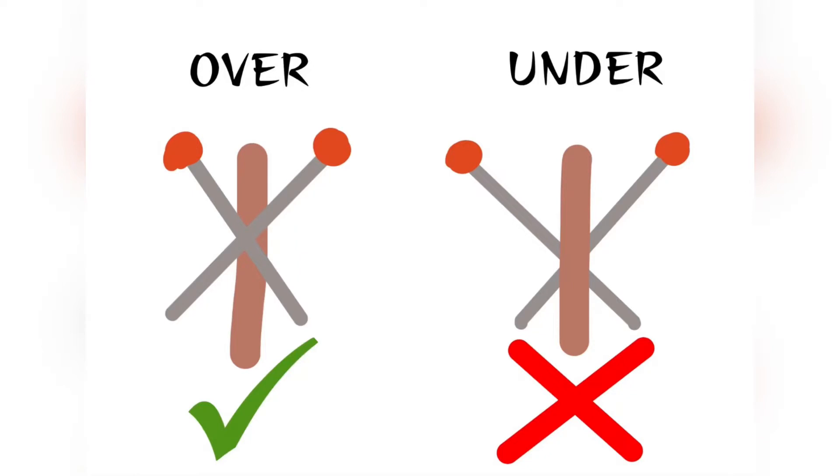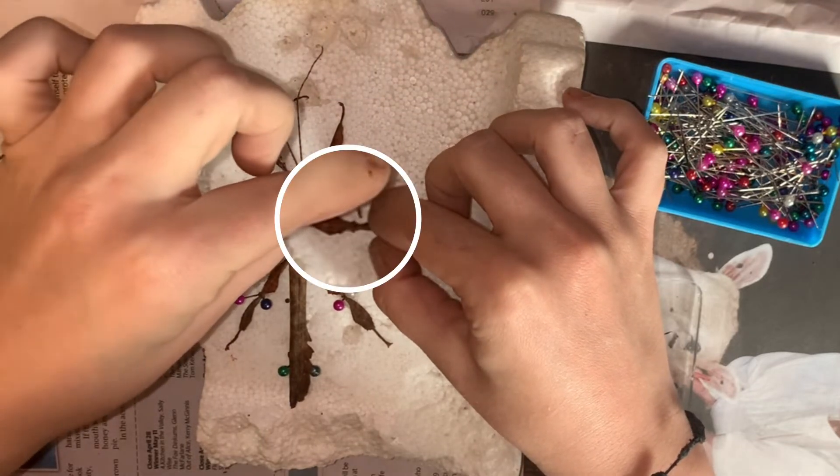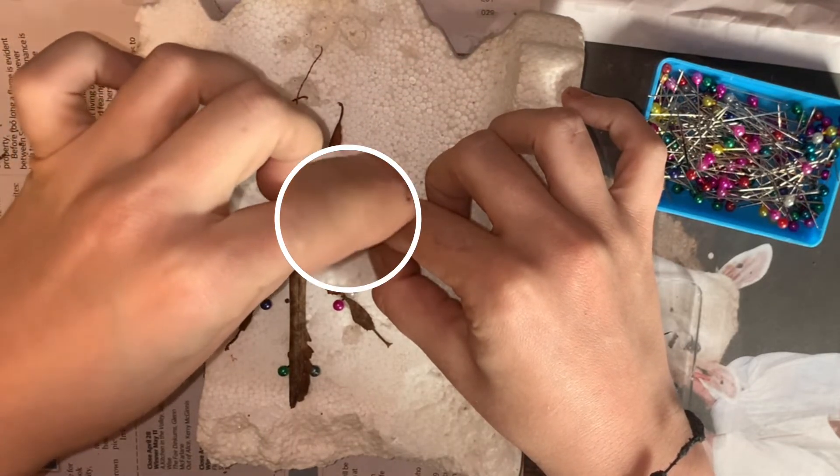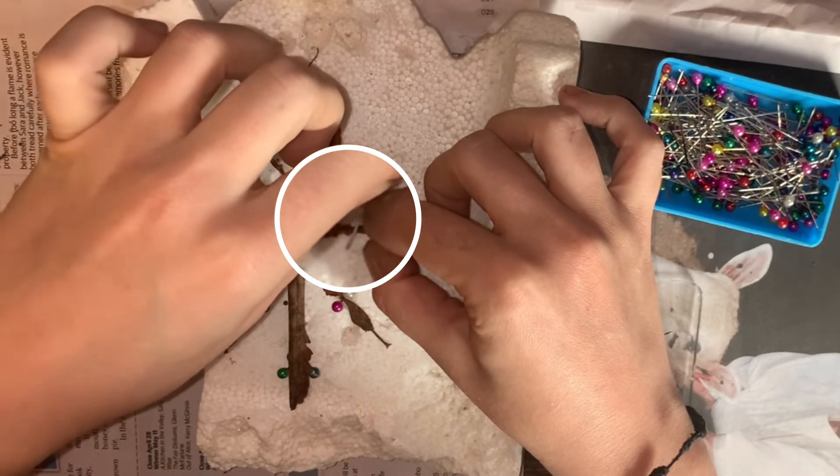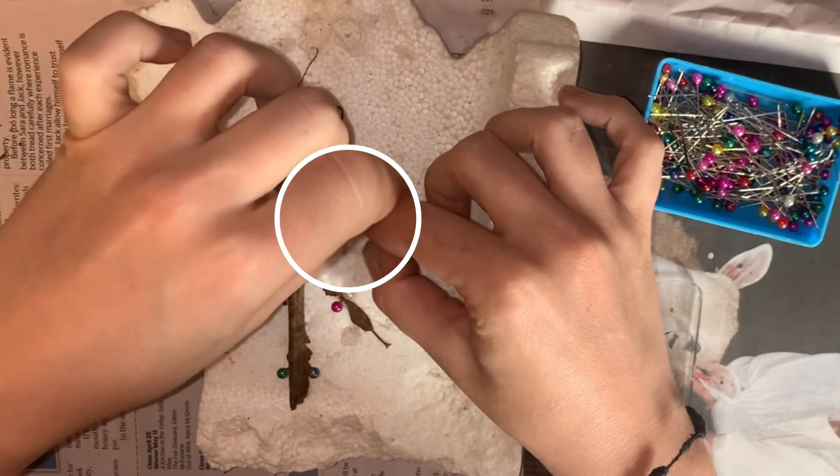For a sturdier position, cross the pins over the limbs rather than underneath. Now we can move on to the middle legs. Cross two pins over the femur and tibia joint, just like we did with the hind legs. Repeat the step for the remaining limbs.